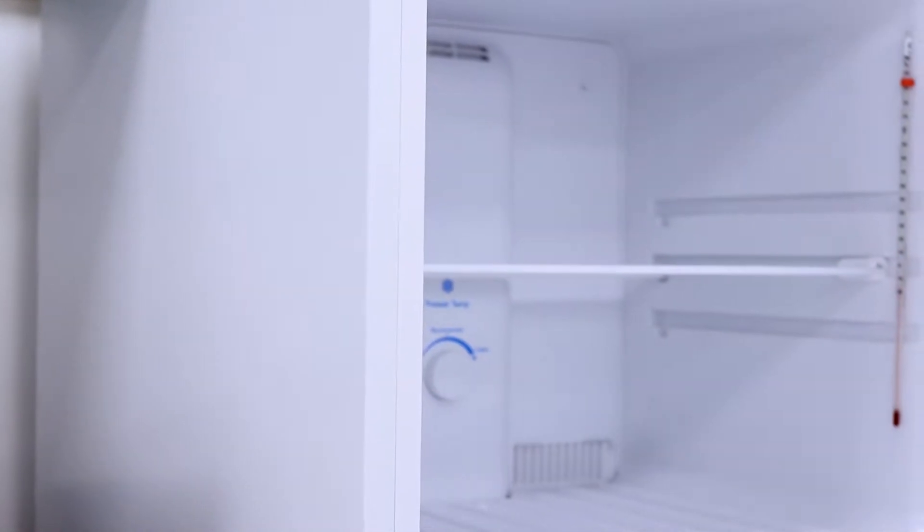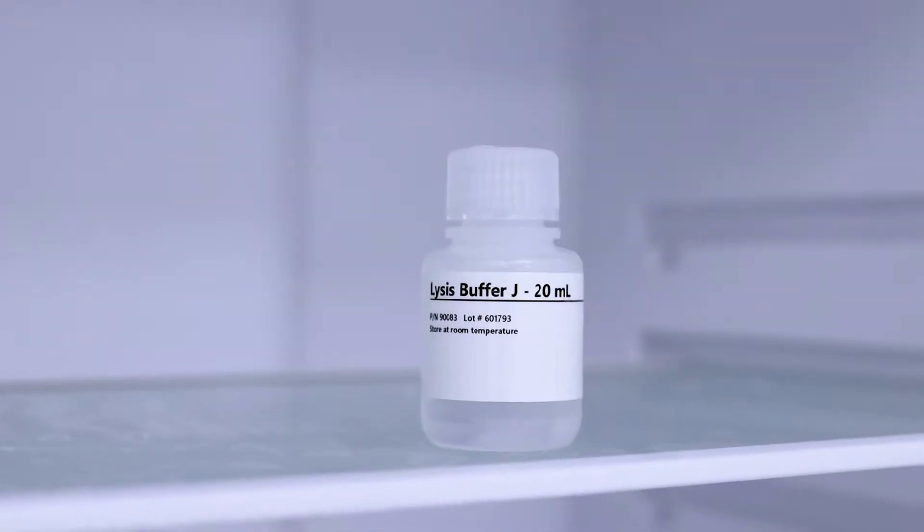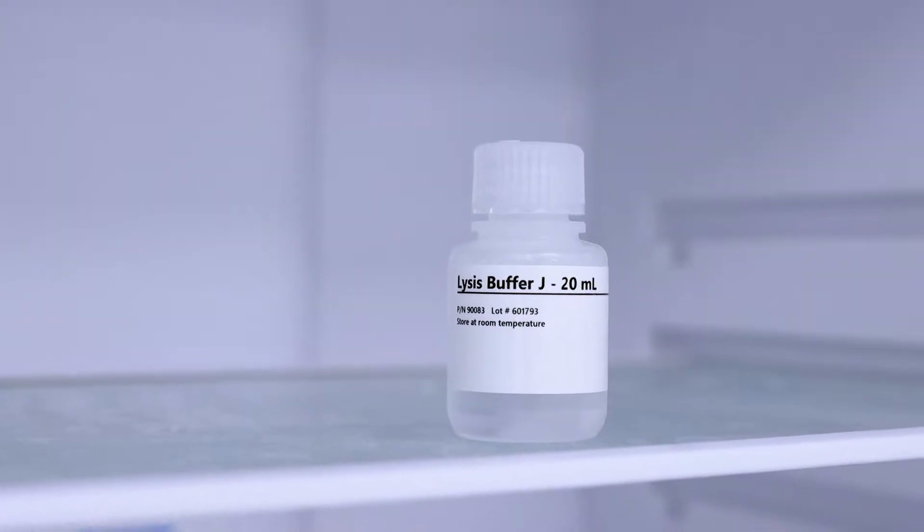Before you begin, make sure to place your Lysis Buffer J in a minus 20 degrees Celsius freezer for 10 to 15 minutes and remove just before use. This is to ensure the separation of cytoplasmic and nuclear RNA.